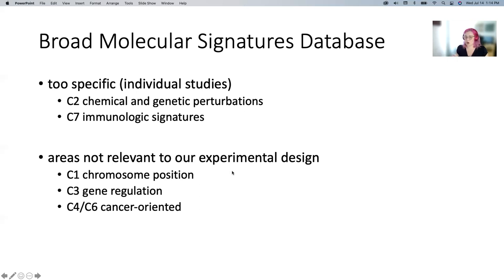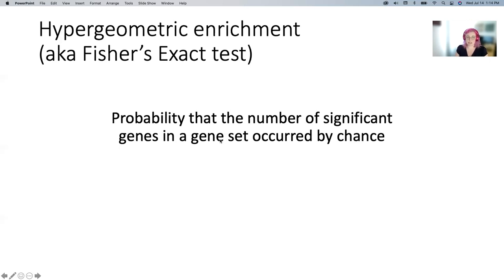Those are what other people have defined as gene sets for us — they're very well accepted and heavily used. Technically though, you could make your own gene sets if you wanted; it's just listing genes that are similar in some way. Using these gene sets, the first thing we're going to do is called hypergeometric enrichment or simple enrichment — which for those with a stats background is under the hood a Fisher's exact test. What it's doing is calculating the probability of the number of significant genes you've defined being in a gene set by chance. So basically: are your gene sets enriched in these significant genes?